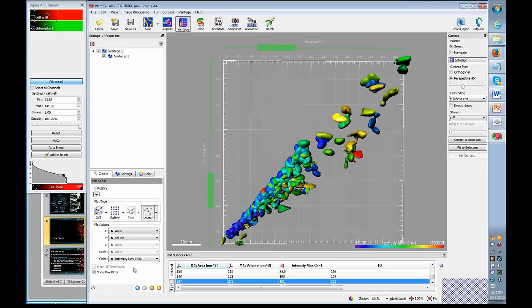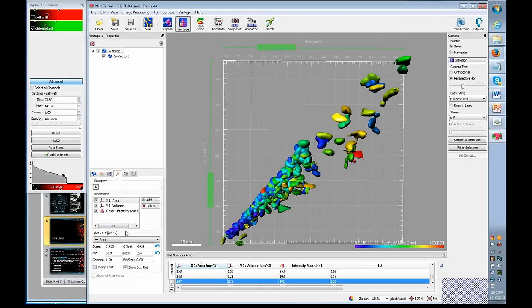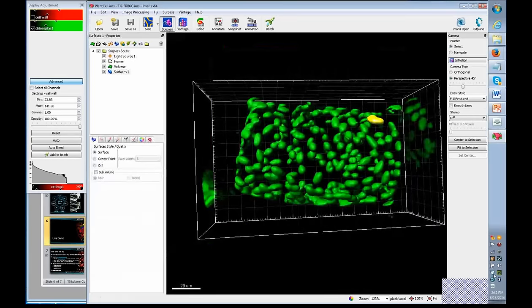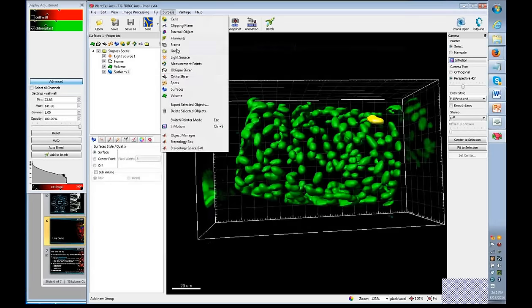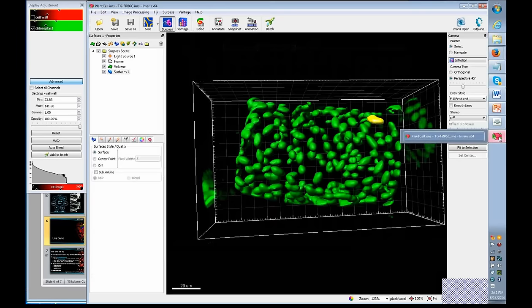And then once you finish the wizard, there are additional options to fine-tune the plot visualization here in the Vantage view. And if you have time series, you can do measurements over time and have a time axis and so on and so forth. Okay, so that's a quick overview. As I said, there's many more modules that we will hopefully cover in other sessions, but happy to take questions now and see how things go.